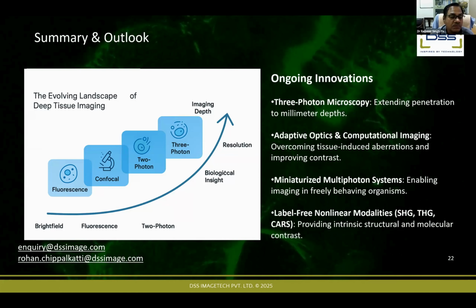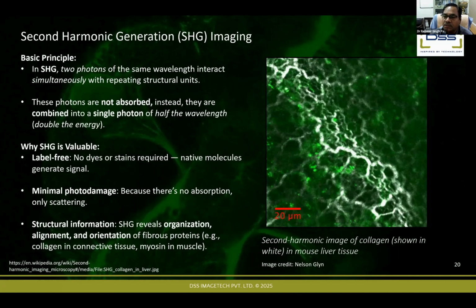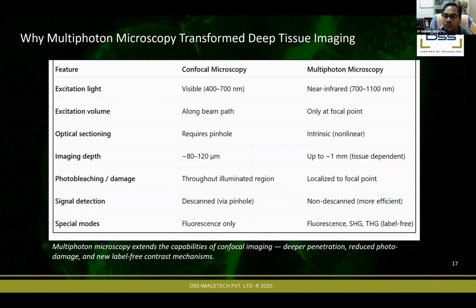May I ask one question, Mr. Rohan? Yes. I'm still confused after seeing all your multiphoton and confocal material. As a pathologist, I used to attend stained slides, and I feel very comfortable seeing tissue structures under a bright-field microscope. Of course, the slide is very thin and stays there, and only then can we watch.